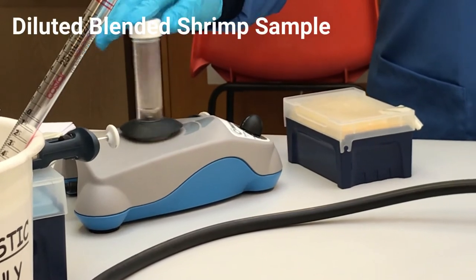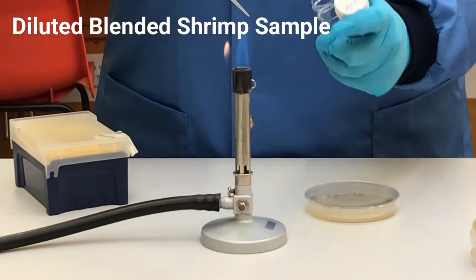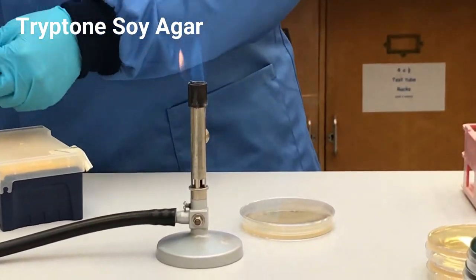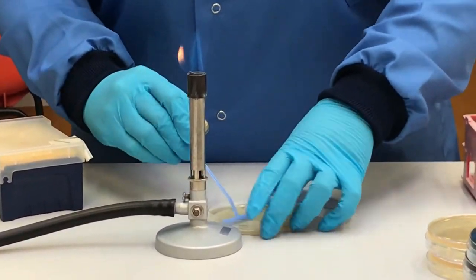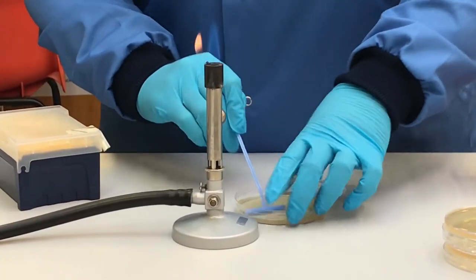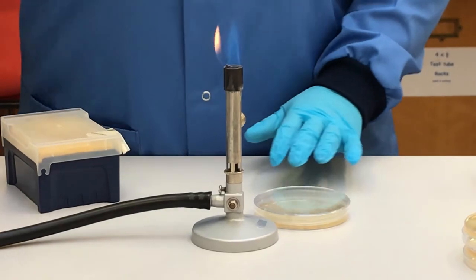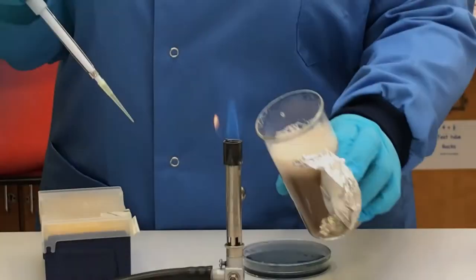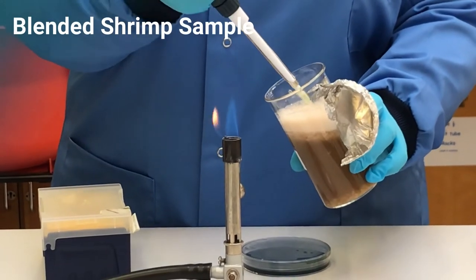Repeat these steps for the other Sample A dilutions, remembering to vortex before removing 0.1 ml from each sample. Repeat the above steps for Sample A.